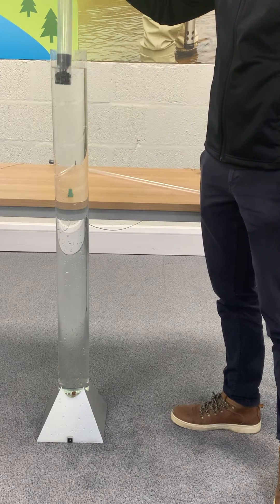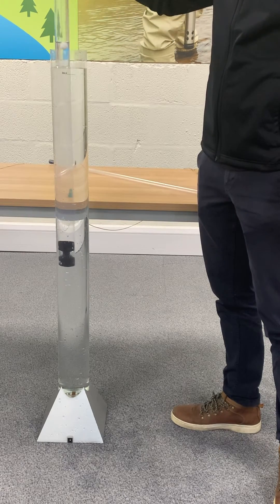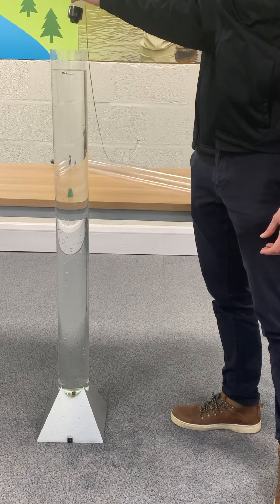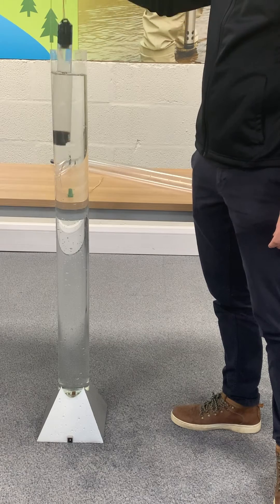For LNAPL, a baler is available with a ball valve which is less dense than water, and as such you will only capture the floating layer. Double valve balers are available to get a kind of crude discrete sample; however, they are not fail safe and the sample mixes all the way down, so you cannot say with absolute certainty where your sample has come from.